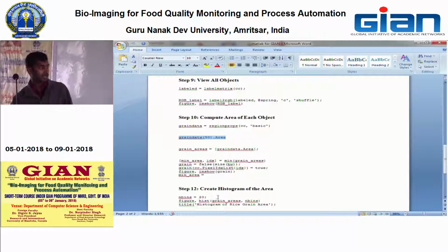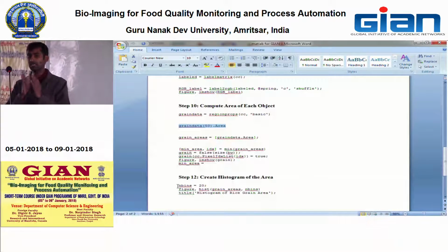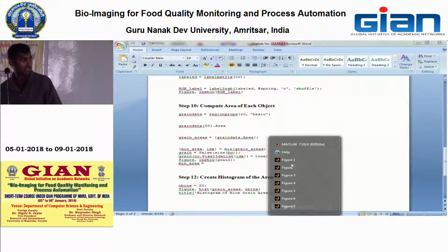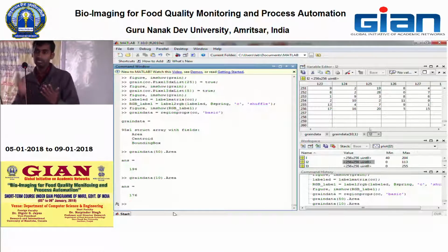And if you want to create a histogram here, you need... histogram. It's like 0 to 255. How many bins you want? So here we put as 20. If you put like 20, then it will give your histogram in 20 columns, 20 bars. You can increase that one.